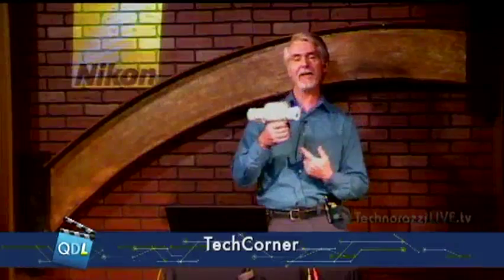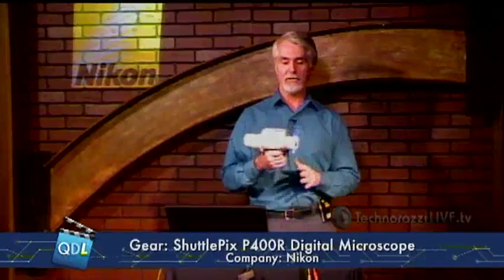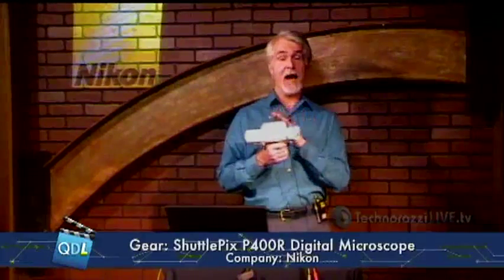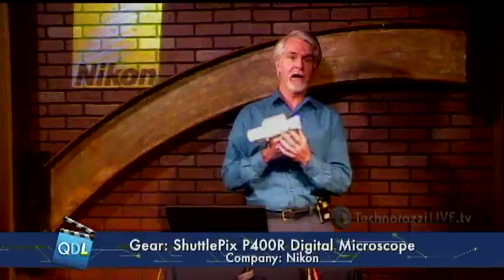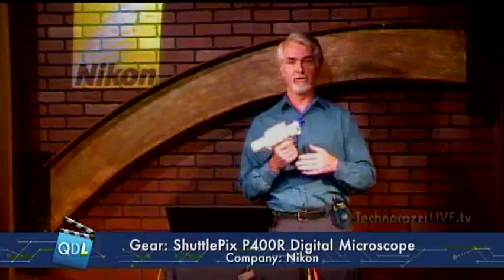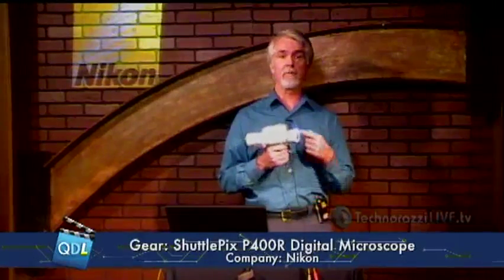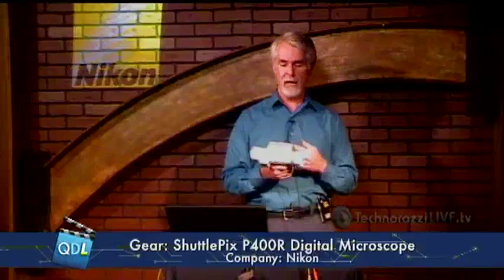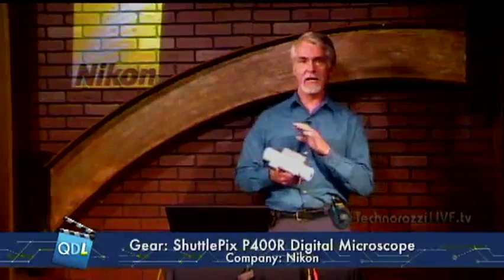This is not a Buck Rogers ray gun — this is actually the Nikon Shuttlepix P400R digital microscope. It's a high-end digital microscope from Nikon, so it has their renowned optics. It features a built-in programmable ring light, 20x zoom, and it's very portable and easy to use. We'll get into the demo in just a moment.